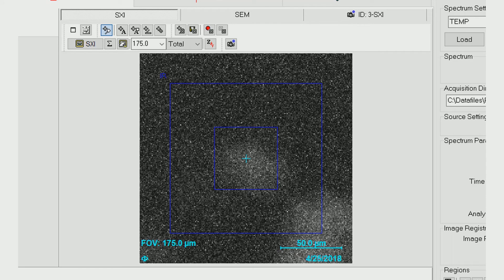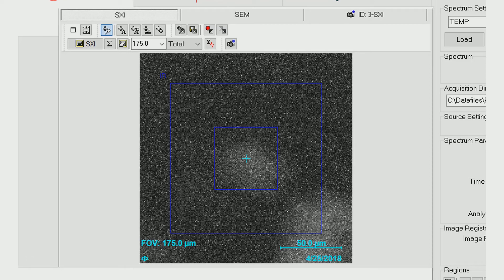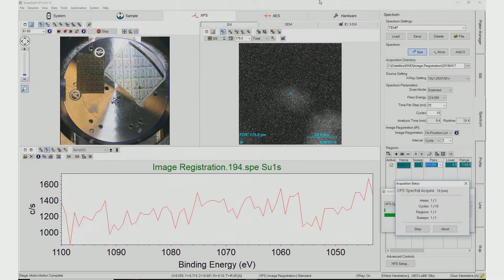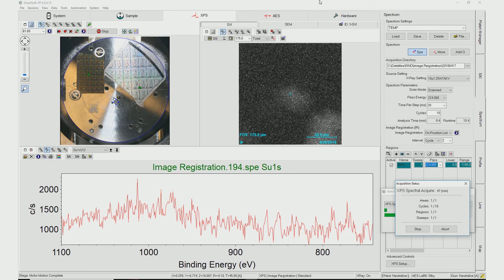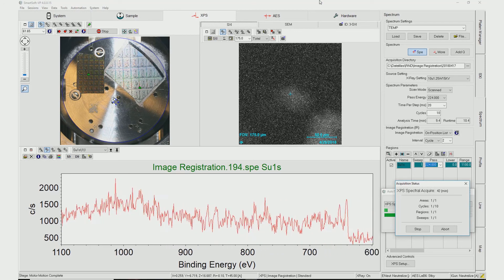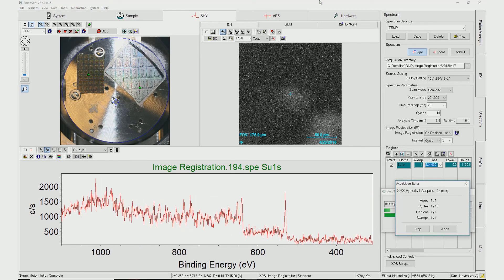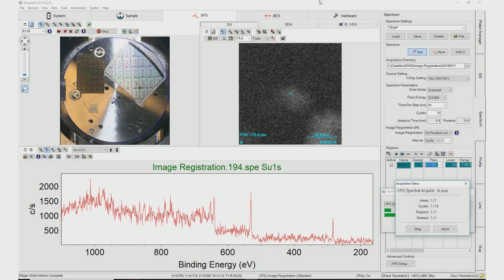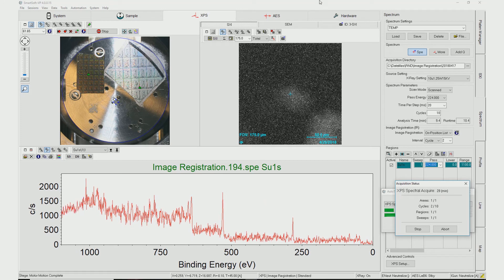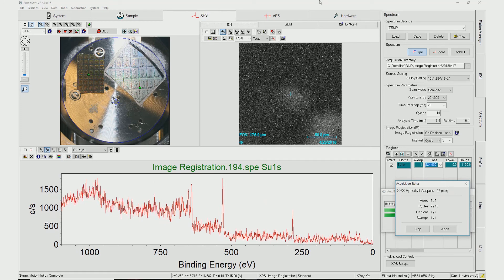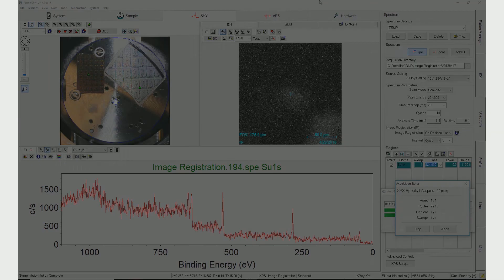As with the first point, Image Registration is performed at the start of the acquisition. In addition, it is also set to run after a designated number of acquisition cycles on this particle. The process is the same: an SXI is generated to confirm the location of the distinct feature. If the feature is in a slightly different location, the X-ray beam will move to the correct location and analysis will continue.